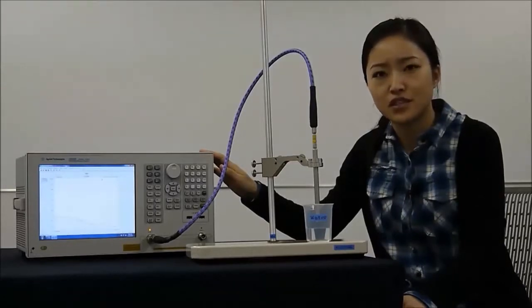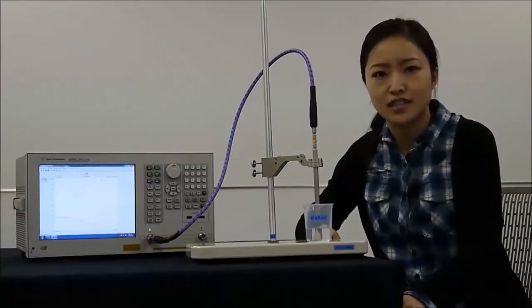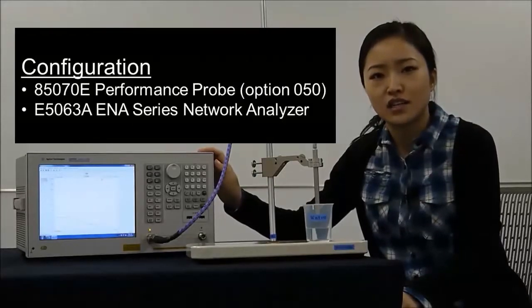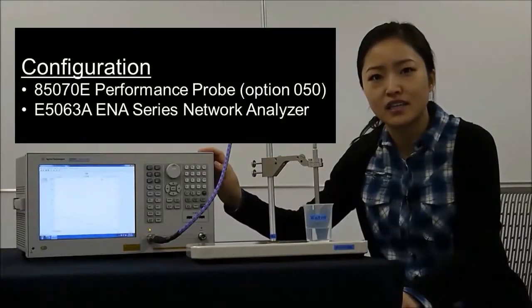The system can measure liquid materials quickly and conveniently. You can set up the system in minutes and measure materials in seconds. A typical coaxial probe system consists of a vector network analyzer, an open-ended coaxial probe and software.